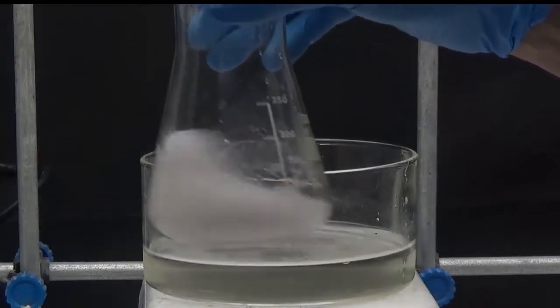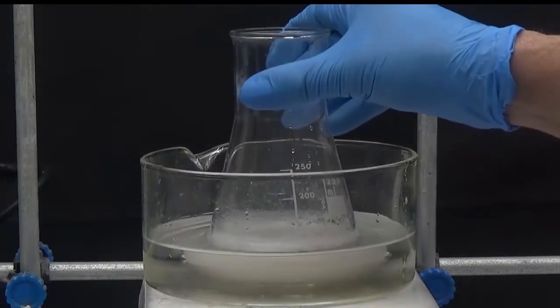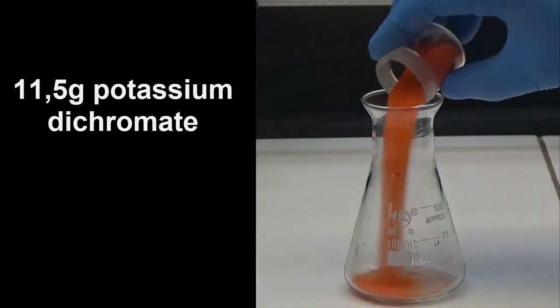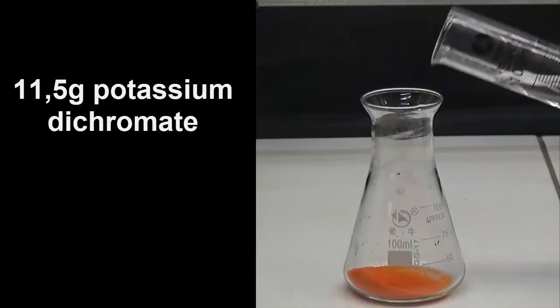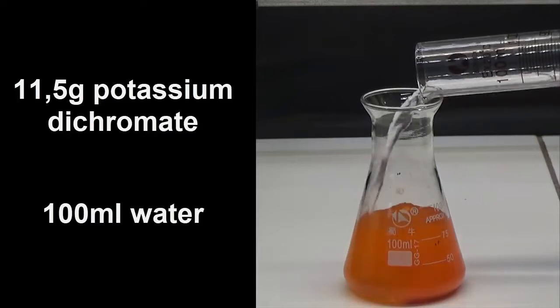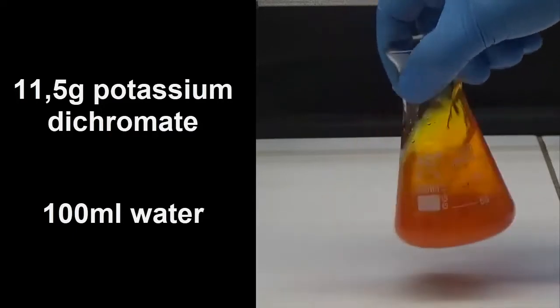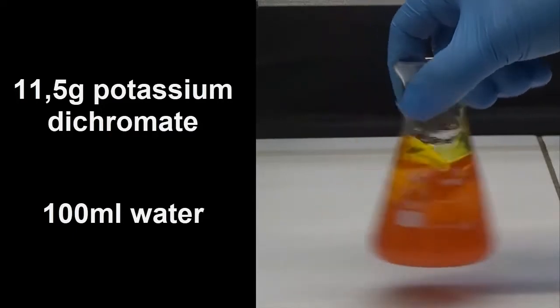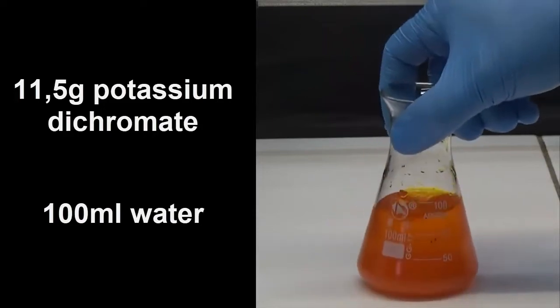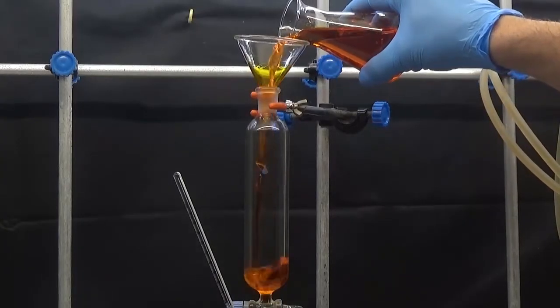Make a solution of 11.5 grams of potassium dichromate in 100 milliliters of water. Put the dichromate solution in an addition funnel.